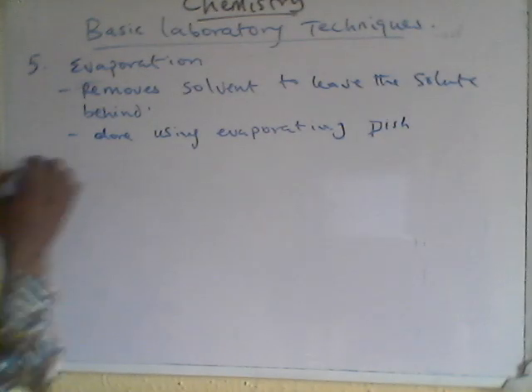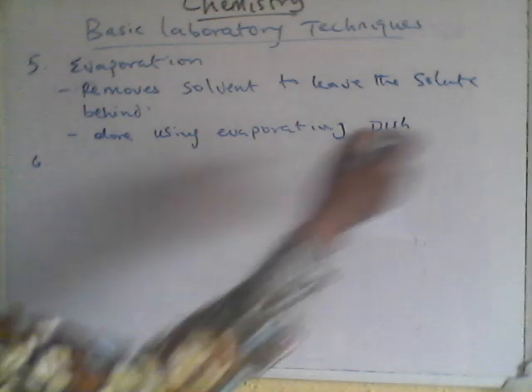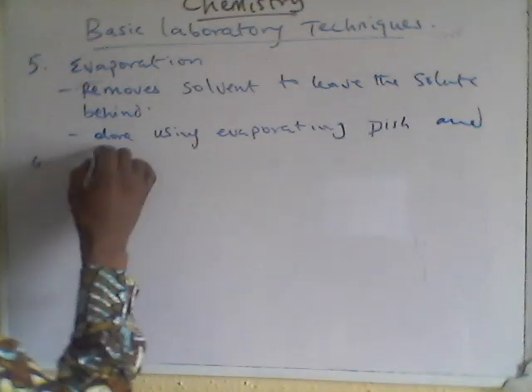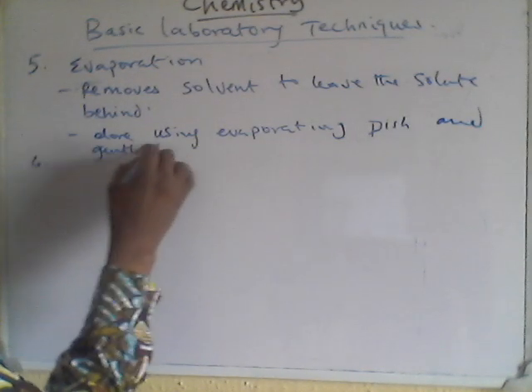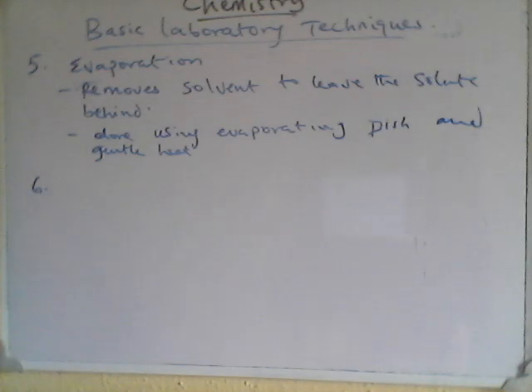Okay, so number 6. We can also use gentle heat, just to heat it gently. So number 6, the procedure is measuring volume.